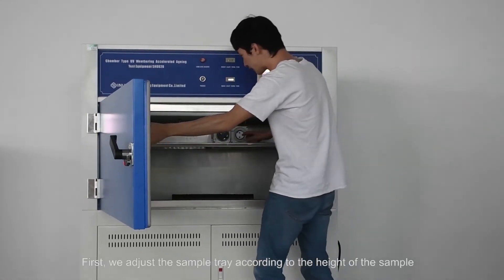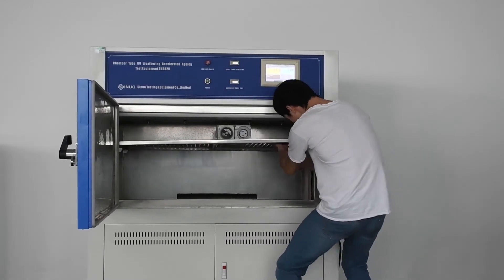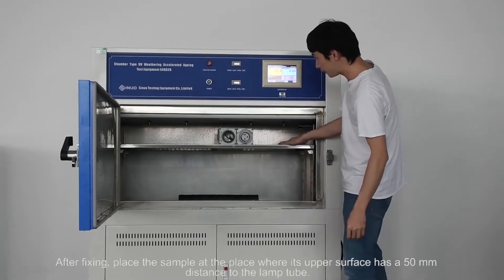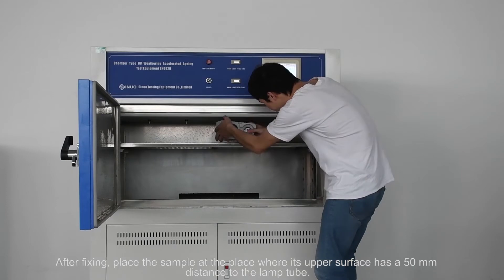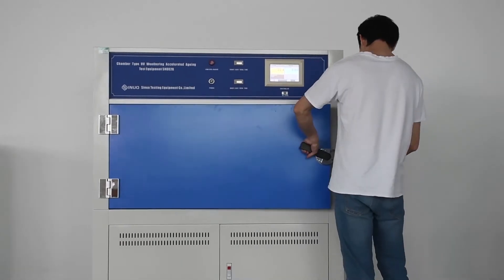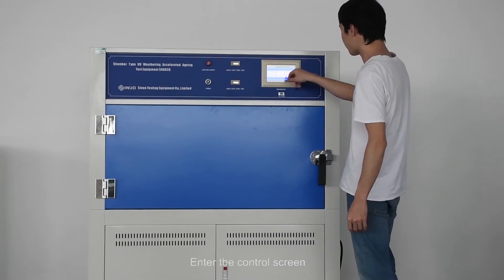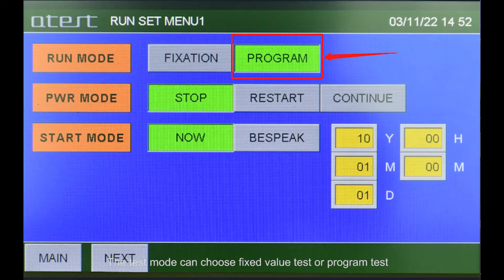Next, we introduce the test steps. First, adjust the sample tray according to the height of the sample and put the snaps in the proper place. After fixing, place the sample so that its upper surface has a 50-millimeter distance to the lamp, then close the door.